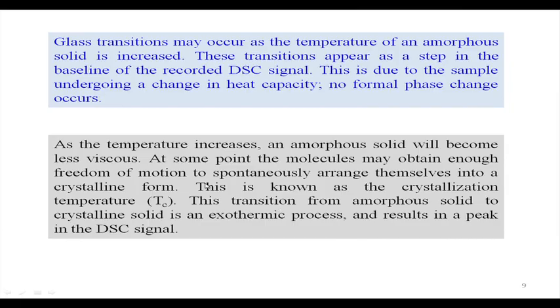So, this Tc is useful to monitor the corresponding crystallization process. Not only the glass transition, we can also monitor the crystallization temperature.